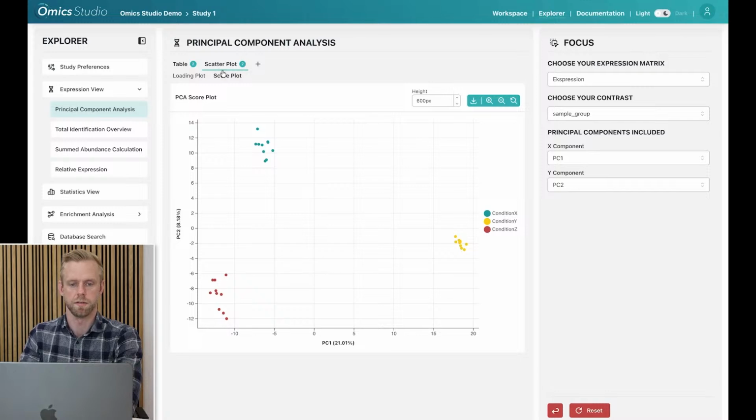And you see, first we're looking at the score plot here. So here we have the different samples according to the variance from principal component 1 and principal component 2. And what is very nice with this cell study is that we can actually see some nice clustering of the different sample groups. But this would also be where you potentially could see an outlier if we had a sample that was very long away from everyone else.